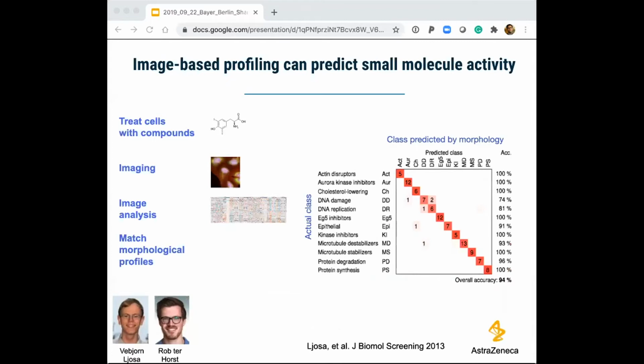So let's apply that information in images to important challenges in drug discovery. This is an example that you might have seen many times before. It's one of the earliest applications, which was grouping chemicals based on the morphologies that they induce in cells and assigning mechanism just by guilt by association. That is, compounds that induce similar phenotypic response may have a similar mechanism. And as you can see in this experiment, this approach worked. Compounds that are already known to have the same type of activity grouped together. Most predictions correctly fall along the diagonal. But this experiment was a simple case of using strong compounds with visibly obvious phenotypes, so it was far too easy in that sense.